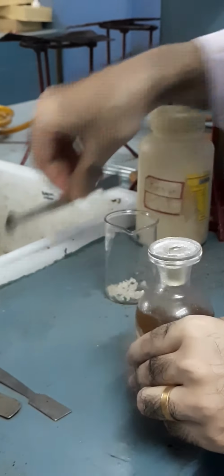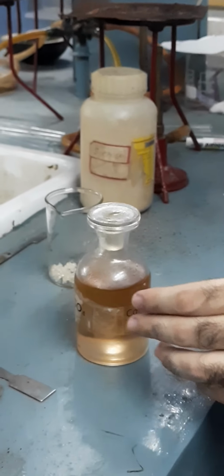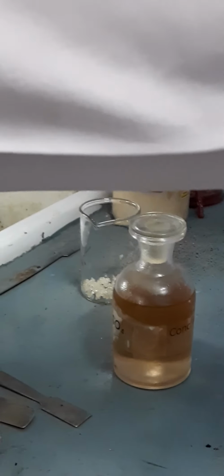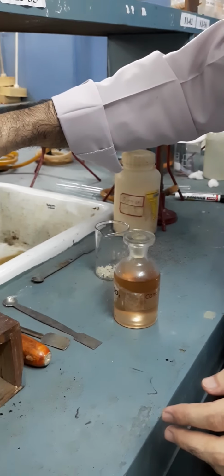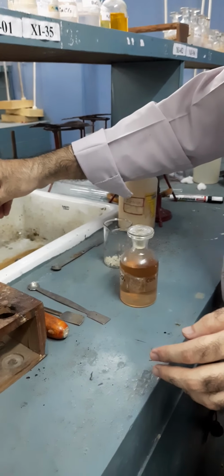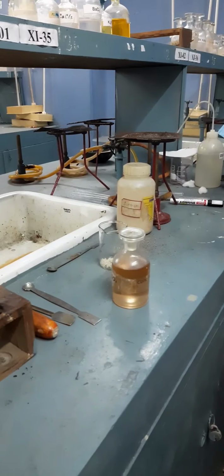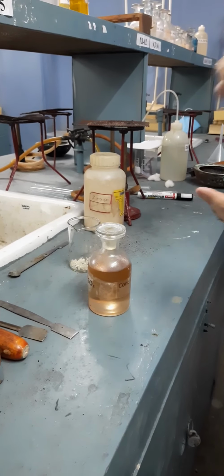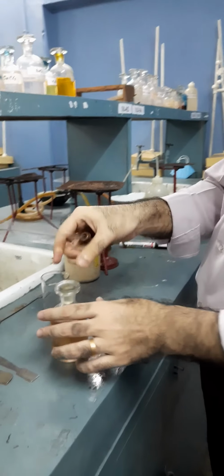Now, this concentrated sulfuric acid is highly dangerous. So be very careful while using this sort of concentrated acid. With concentrated sulfuric acid, or any sort of concentrated acid, we should be very careful. Washing the apparatus is also one of the important things before using any chemical.